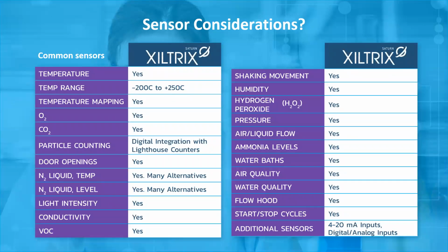Yeah, sure, Han. So it's really funny. I was in a facility last week on the East Coast, and yes, the example of portable EC units was very, very appropriate and not a permanent solution. But looking at these sensors, as you rightly pointed out, Han, it's not good enough anymore to just measure an individual piece of equipment. You need to at least also introduce the factor of the ambient circumstances, being temperature, relative humidity is very, very important, and in understanding the behavior of certain equipments.